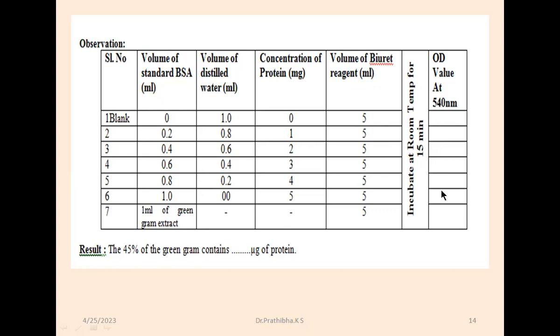Okay, once you get the standard, on top of the standard you are going to plot the unknown OD, and then you will get some amount of concentration in micrograms of protein. And the salting out we are performing here for 45% of the green gram. Okay.